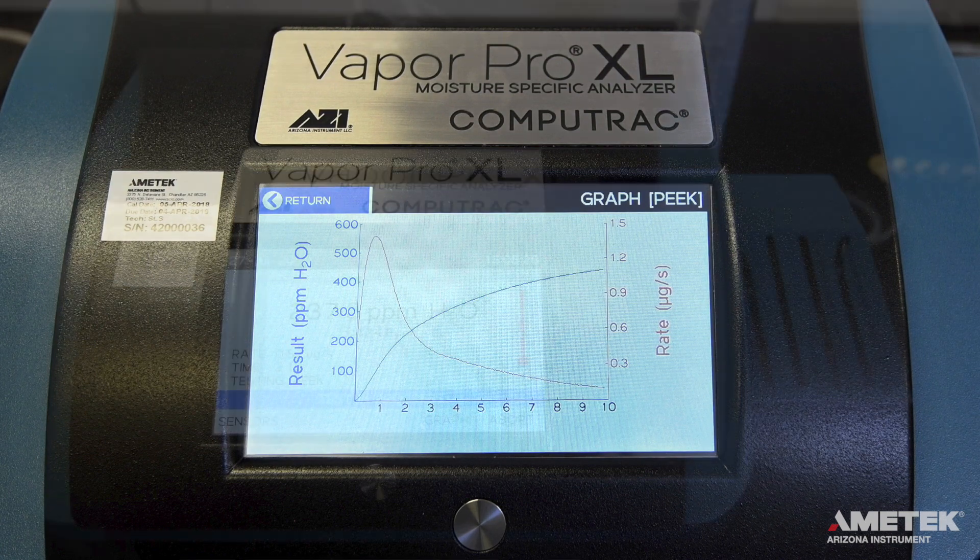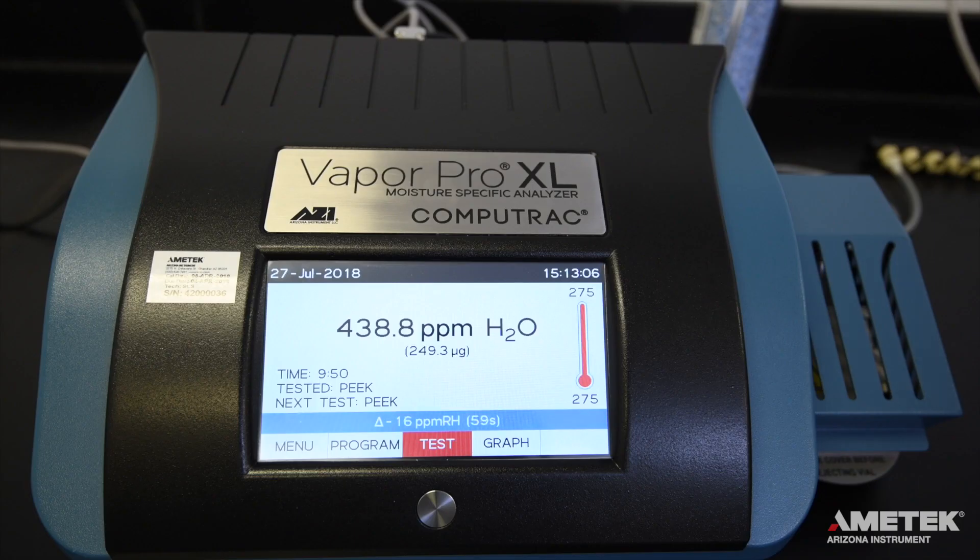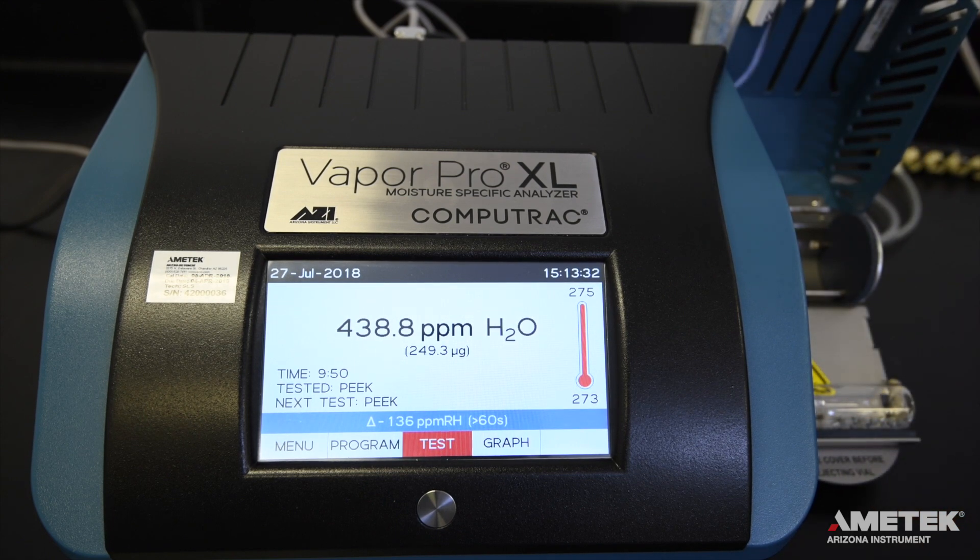Once the programmed ending criteria is met, the instrument will beep signifying the end of the test. The bottle transport will activate and eject from the heater. Once fully ejected, press the silver lever at the bottom of the ramp to remove the hot vial from the transport mechanism. You can now open the ramp cover, but be careful — the bottle is still very hot, so do not touch it until it has cooled down.